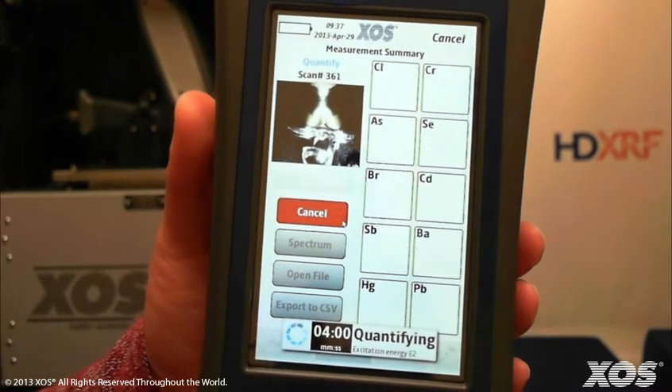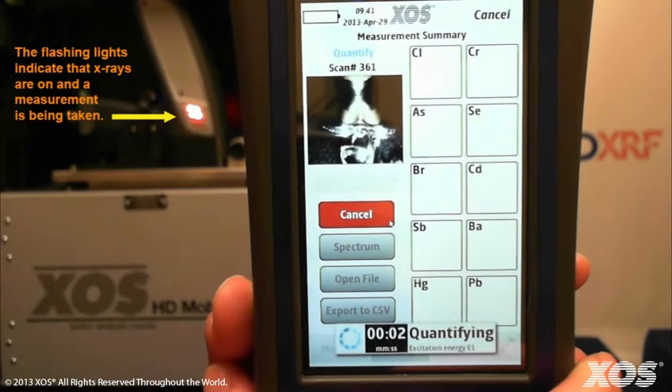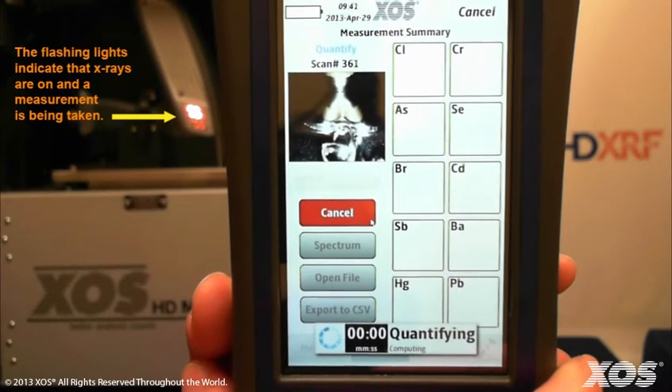Unlike screening, quantification has pre-set measurement times. For metal samples, the measurement time is 4 minutes and results will not appear until the full measurement is complete.